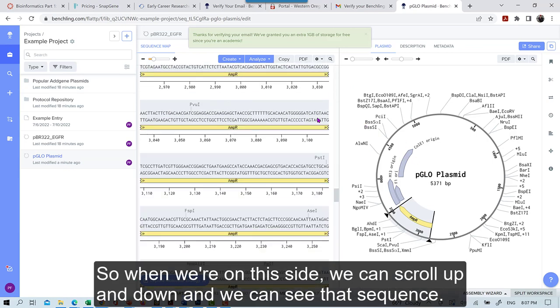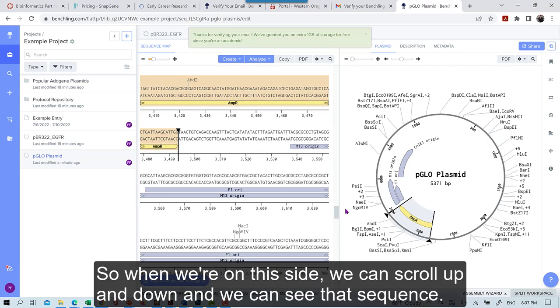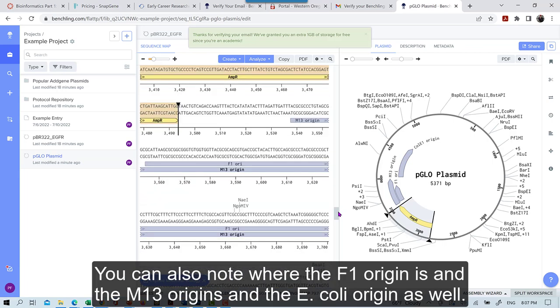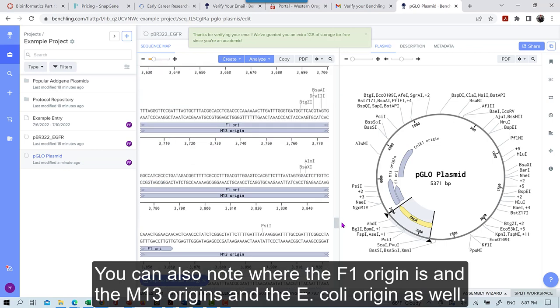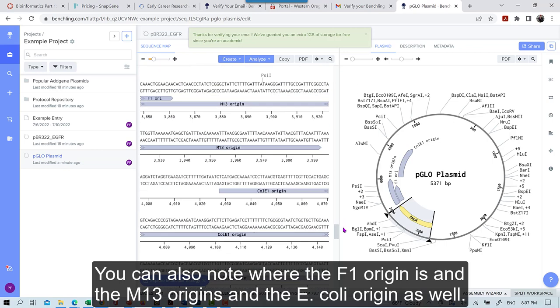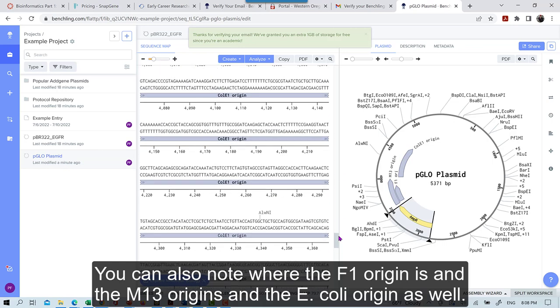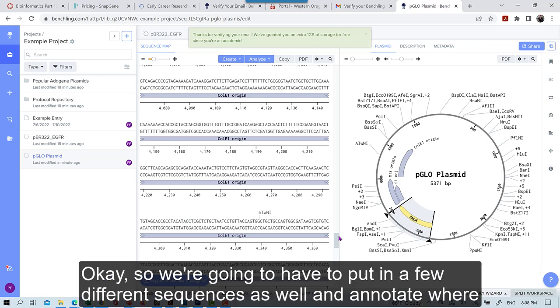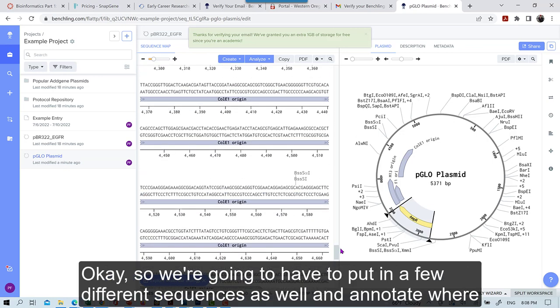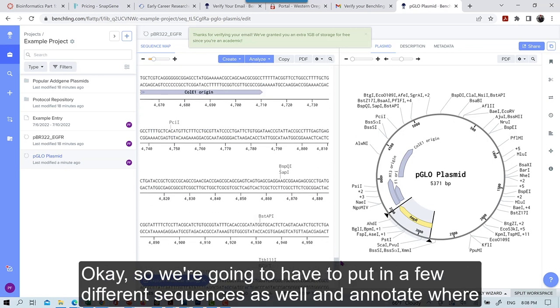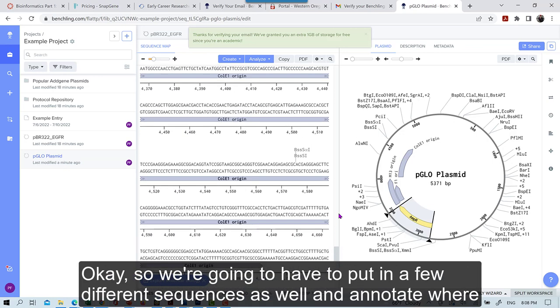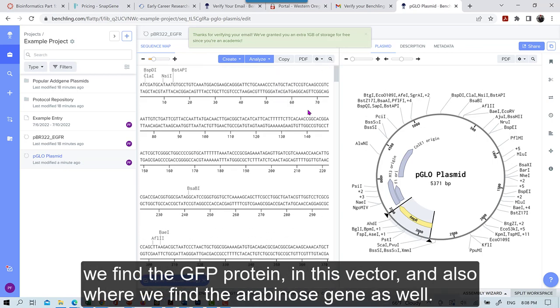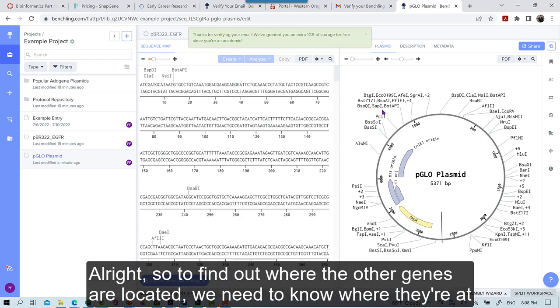So when we're on this side, we can scroll up and down and we can see that sequence. You can also note where the F1 origin is and the M13 origin and the E. coli origin as well. Okay. So we're going to have to put in a few different sequences as well and annotate where we find the GFP protein in this vector. And also where we find the arabinose gene as well.